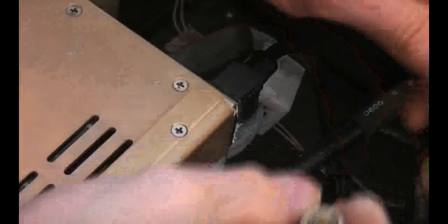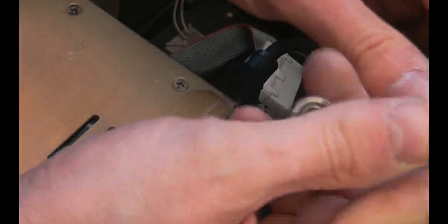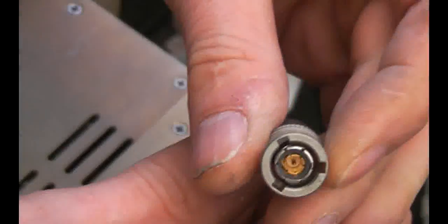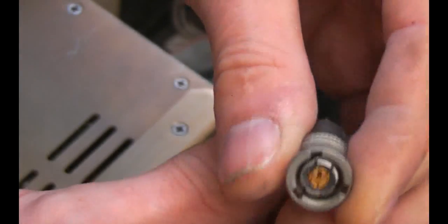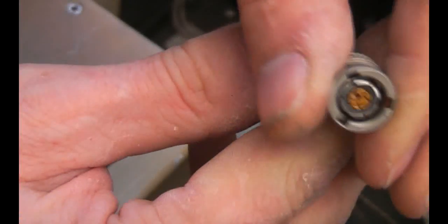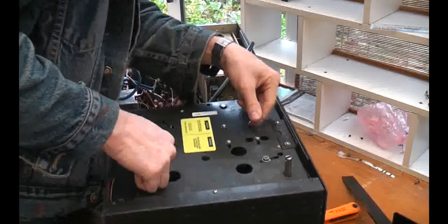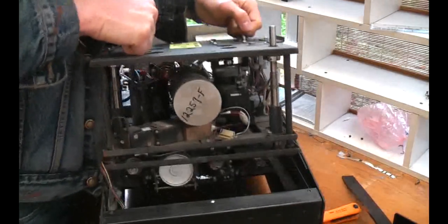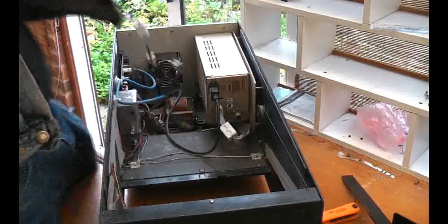There are a couple of interesting BNC variations. This is a high-voltage BNC - I've seen these before. I've not seen this other one before - there's a little gold insert and I think it might actually be a triaxial connector, although it only appears to be connected to a two-core cable. I think it might have an outer shield and then two inner cores.